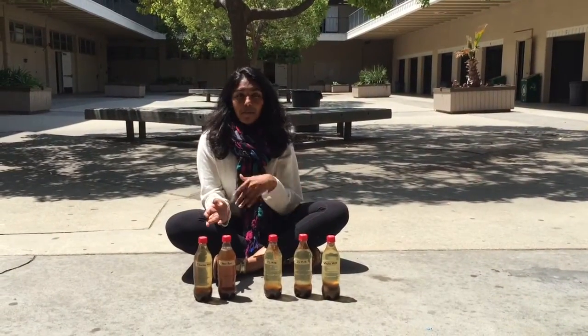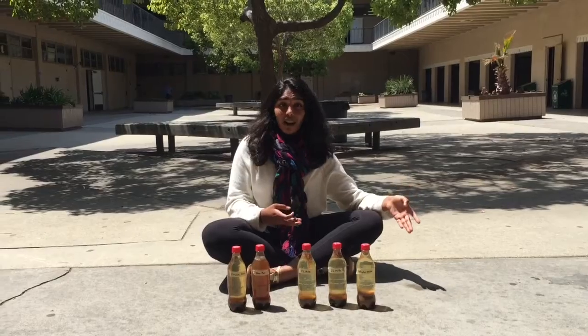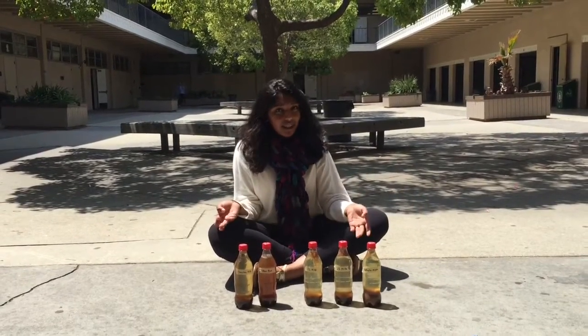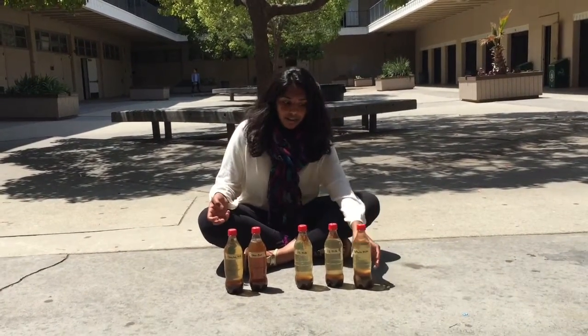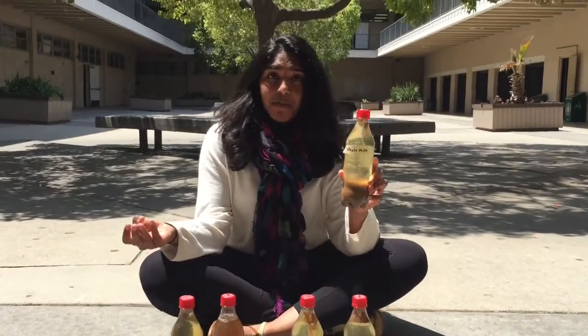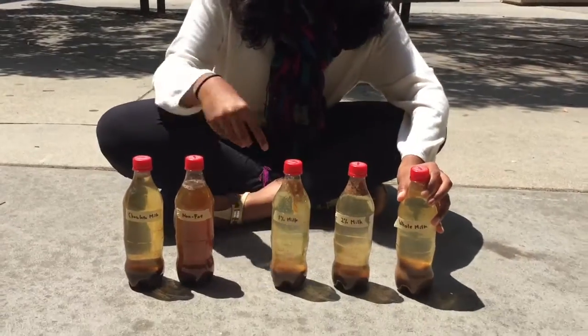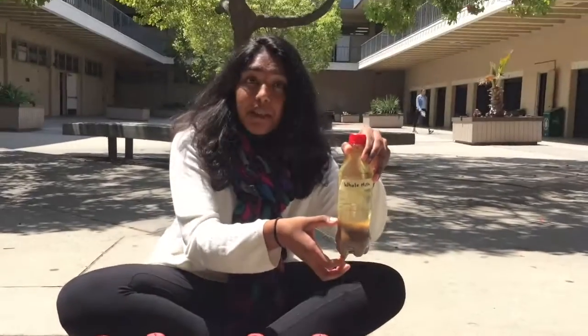The hypothesis at the beginning of this experiment was that the milk with the greatest amount of fat content would have the greatest amount of calcium, and we have proven our hypothesis because we see that whole milk is 3.25% milk fat, right? And you see that out of all of these samples, this has the greatest amount of precipitate.